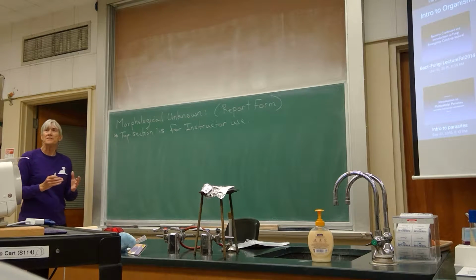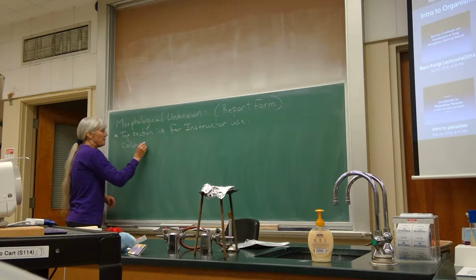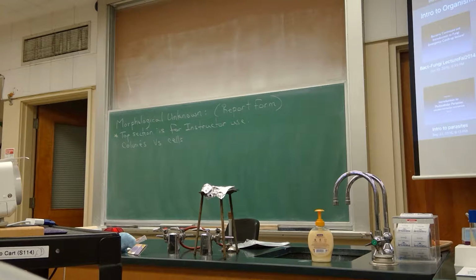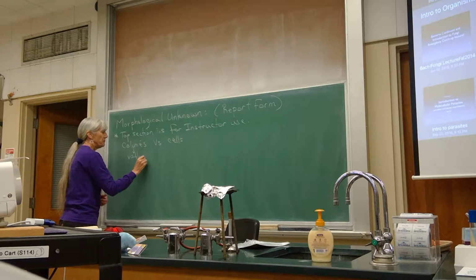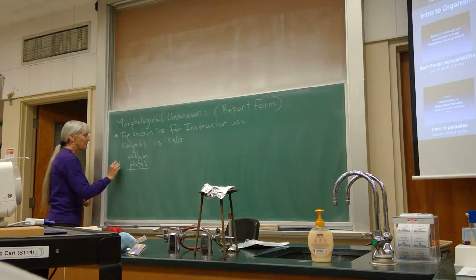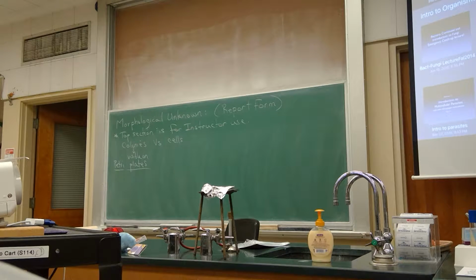And then you need to know the difference between colonies and cells. This comes into play in a couple of places because you have one section where it's asking you about colony morphology. Which of those can you see with the naked eye? Colonies. These are visible on plates, specifically Petri plates. The other thing I found out is people don't know the difference between a plate and a glass slide.